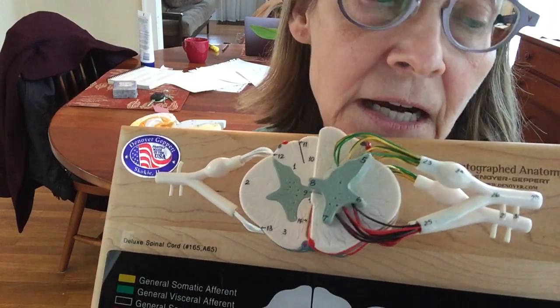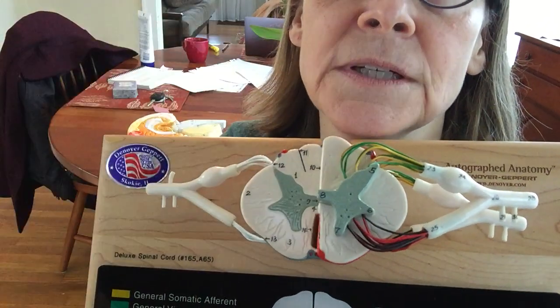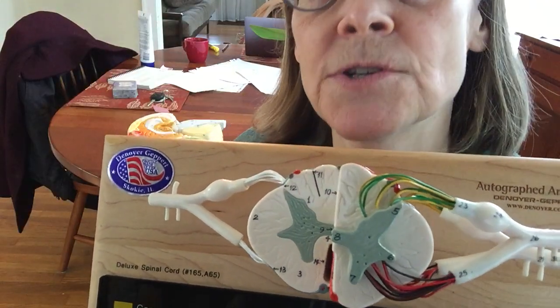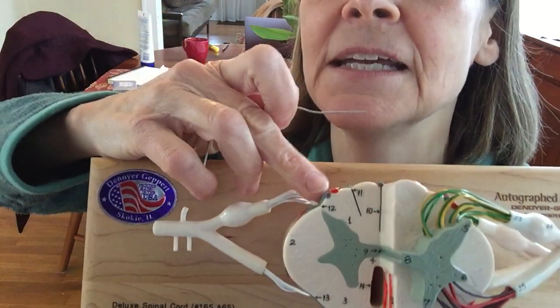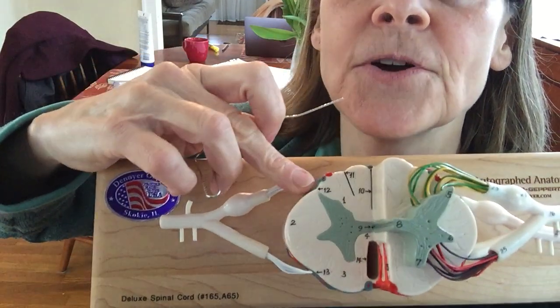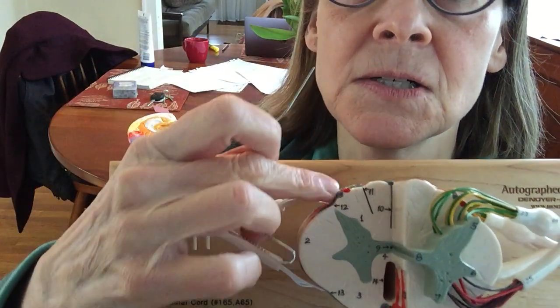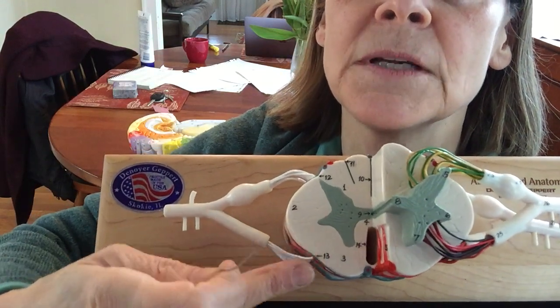All right. I mentioned the central canal. That's the little hole going right down the center. Then you have a dorsolateral sulcus and a ventrolateral sulcus. This was the median, this is the median ventral. So you're going lateral, but it's still dorsal. And here you're going lateral, but it's still ventral.